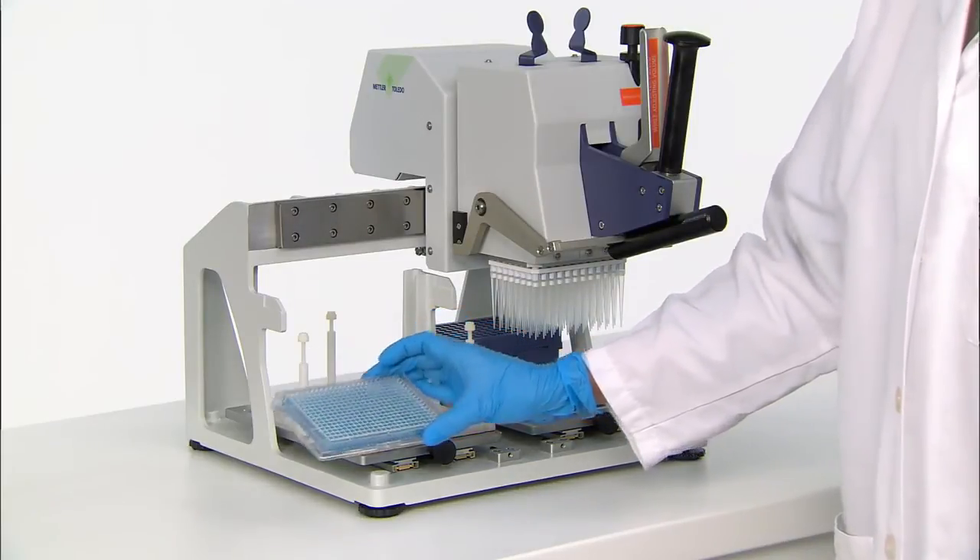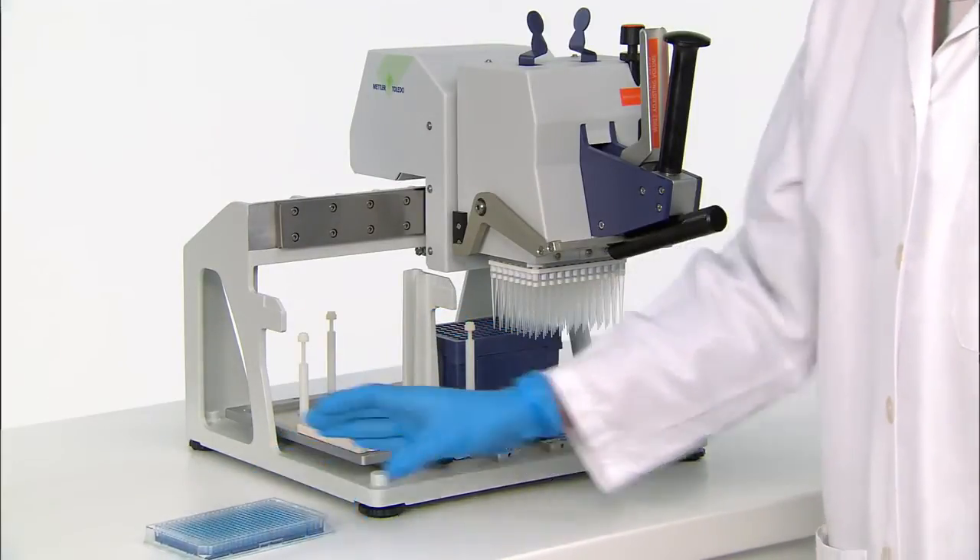We hope you've enjoyed watching this demonstration of the Liquidator 96 in action.